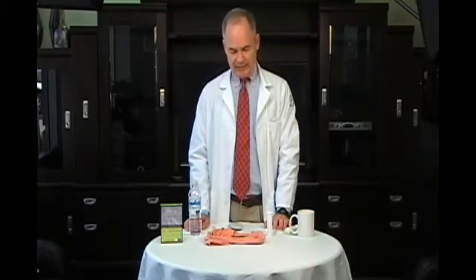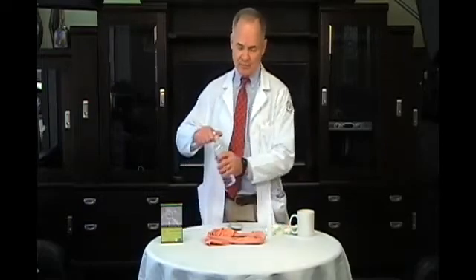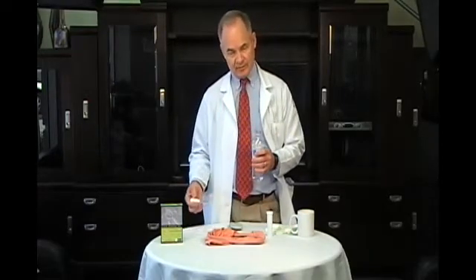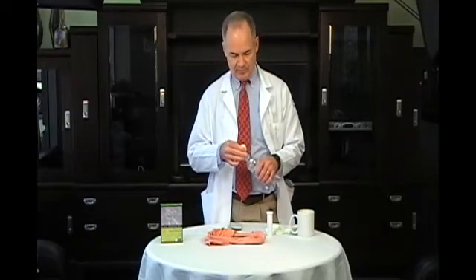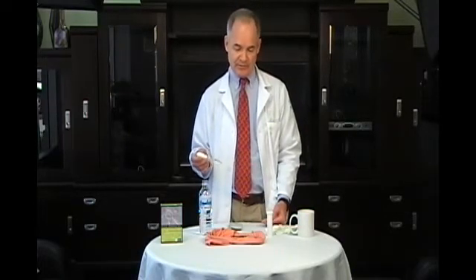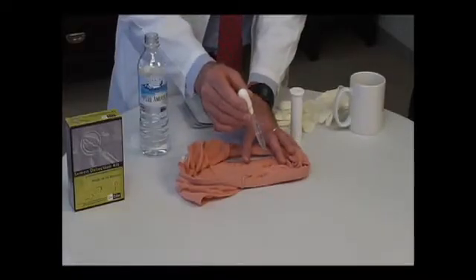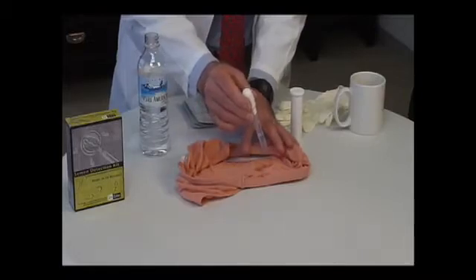What I'm going to do is demonstrate how to test for acid phosphatase first, and then I'll do the test for prostate specific antigen. Now, the procedure is to place 5 to 10 drops of water on the suspected area, in other words, the crotch. Now, sometimes it may take more than 10 drops of water depending on the stain. Sometimes vaginal discharge can be heavy, thick, and it may take more than 10 drops. So you'll just have to look at the stain and estimate how much water it will take to dissolve the substance inside the fabric. So we're going to go 1, 2, 3, 4, 5, 6, 7, 8, 9, 10.